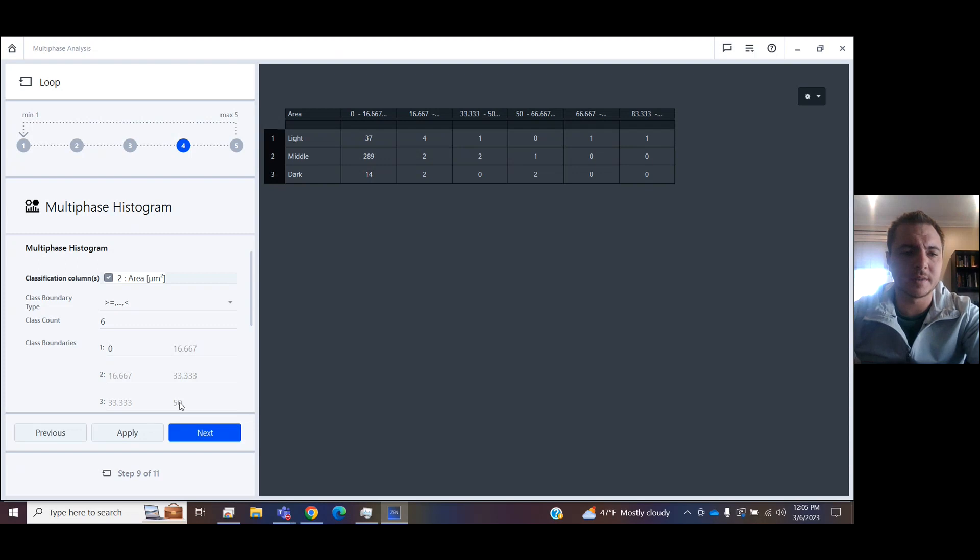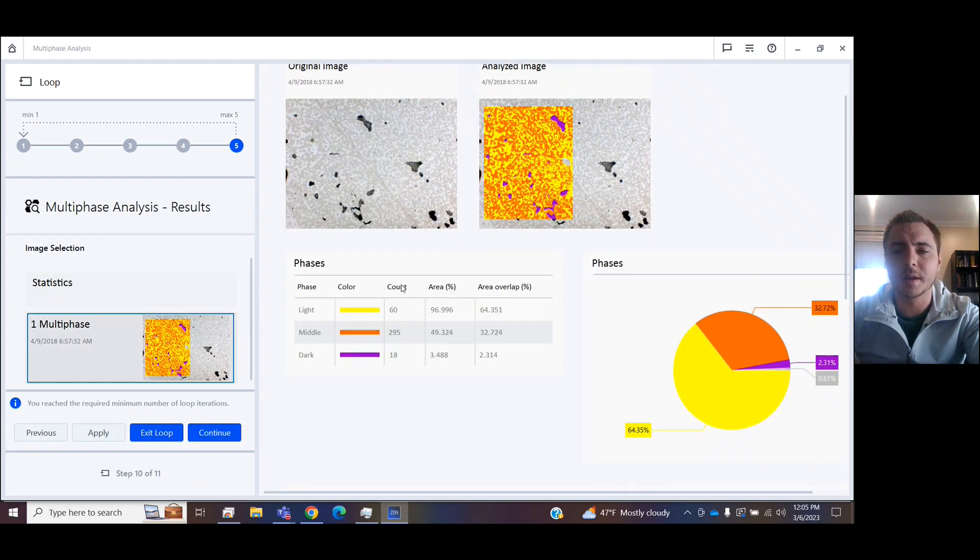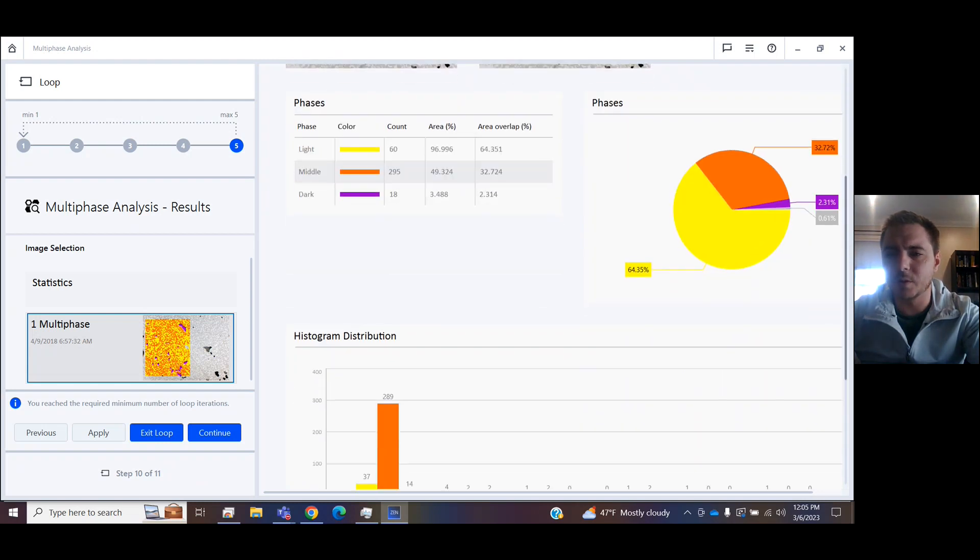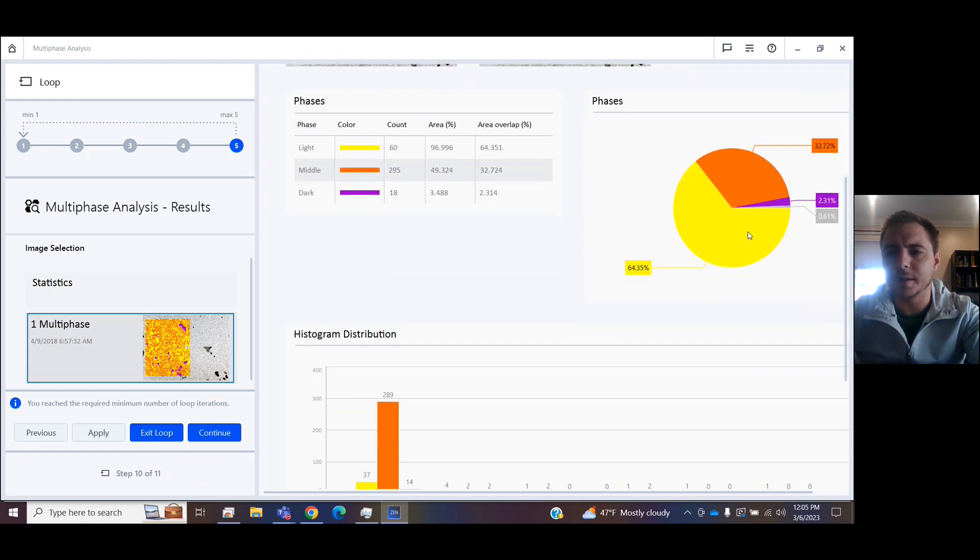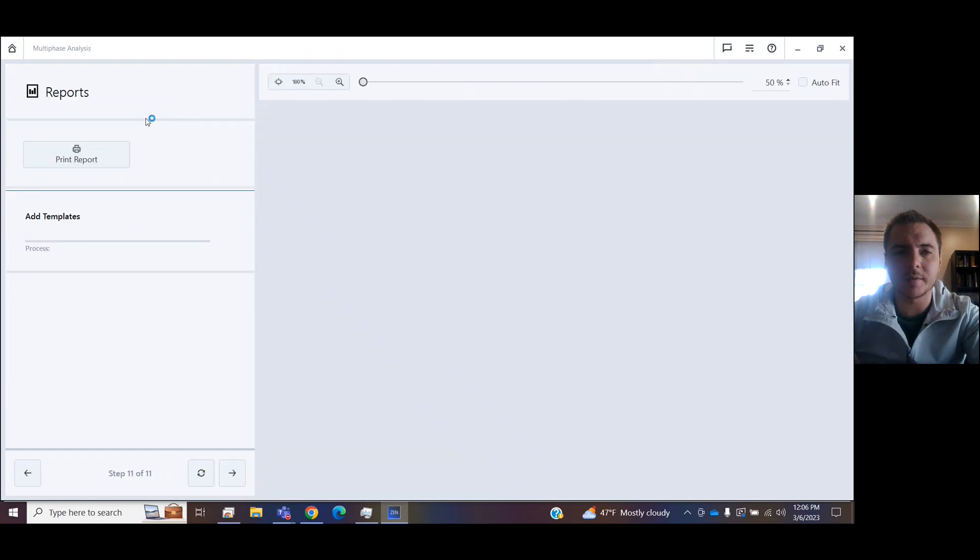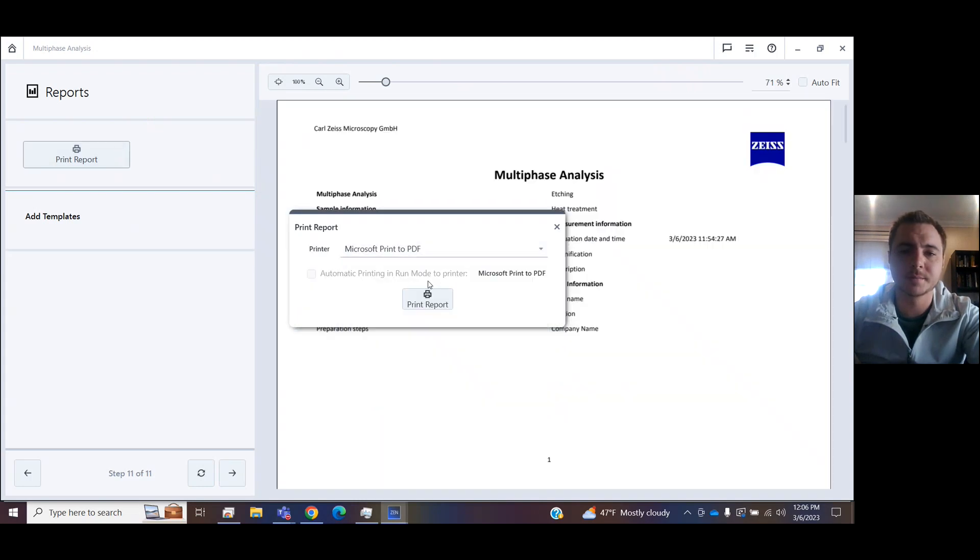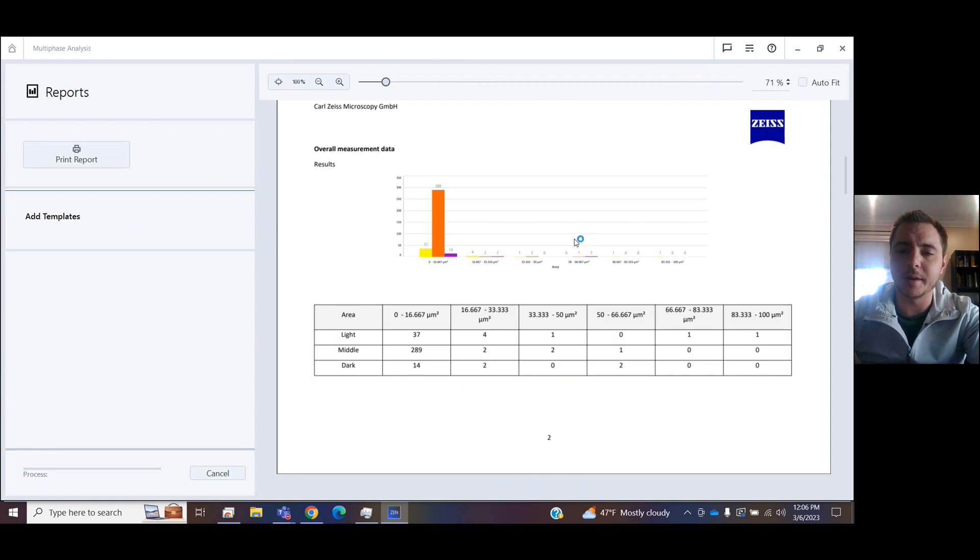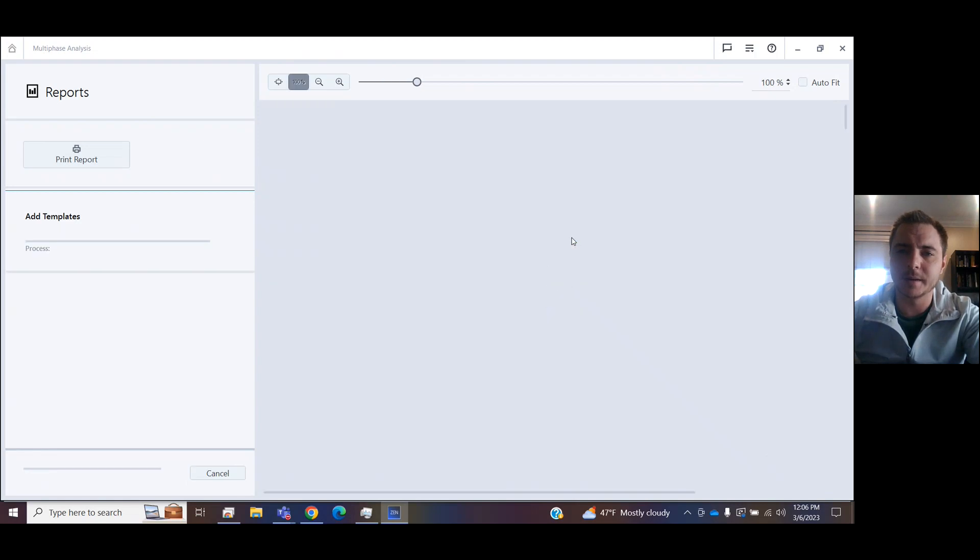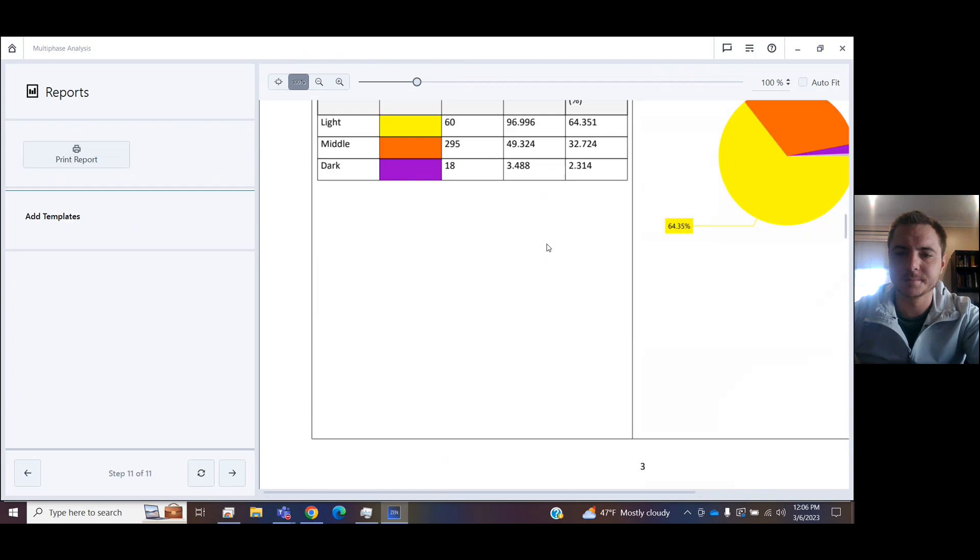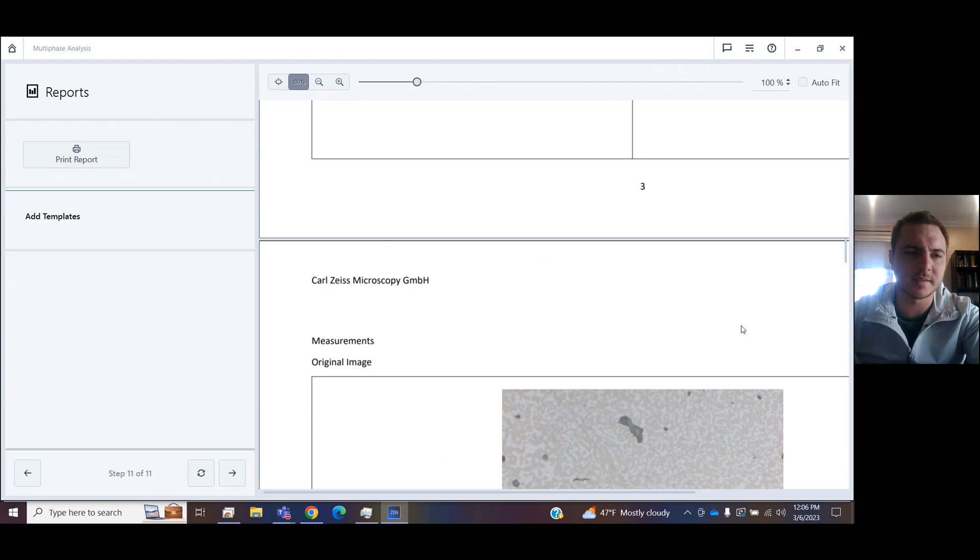Finally, you get a histogram. But what most people are after here is this wheel. And so you can see the breakdown of the different phases in the area that we're measuring. And if we press exit loop, you will have the opportunity to print this report as a PDF, and it comes out nice and you're able to evaluate your results. Thank you for listening and enjoy the Zeiss Zen Core multi-phase analysis module.